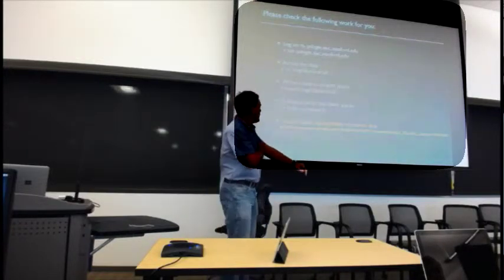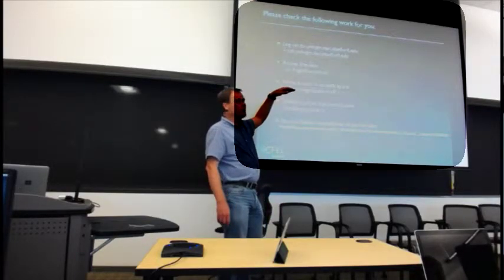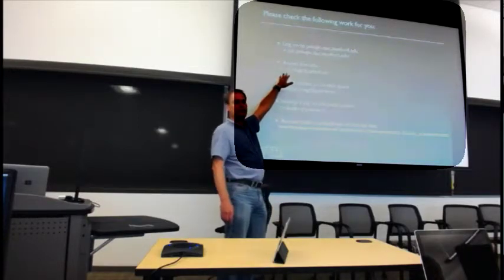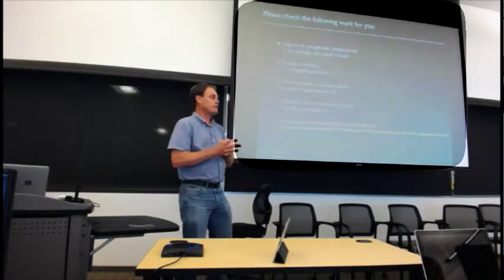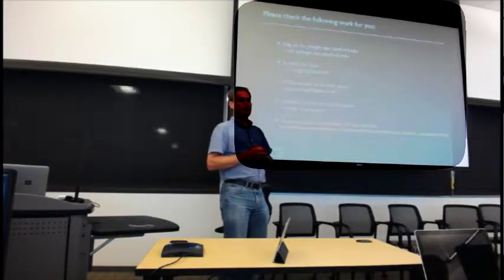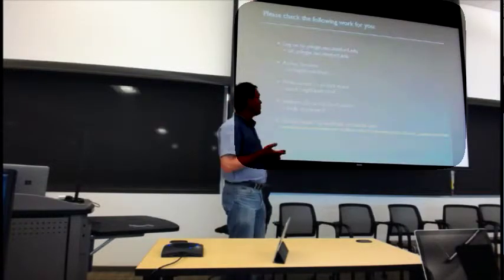This is one of the interesting things when you go and do an experiment, because there are two people who can actually give you access to the data. One is the uber gods, the beamline scientists, who have the power to do everything. But they don't actually do that most of the time, because it's up to the PI to add people's Unix accounts to the experiment, which gives them access to the online logbook, the data, and all of those sorts of things.